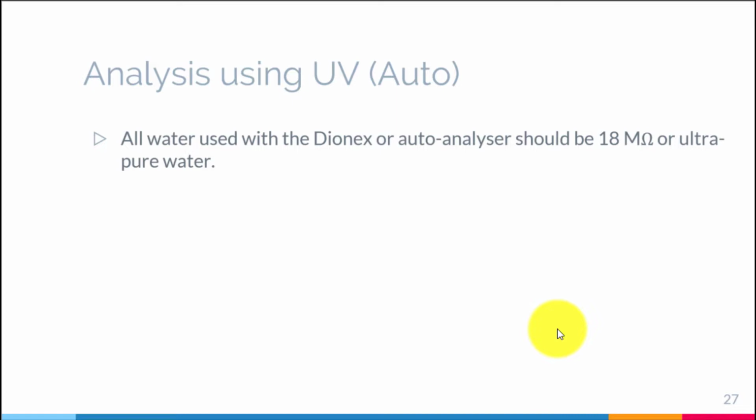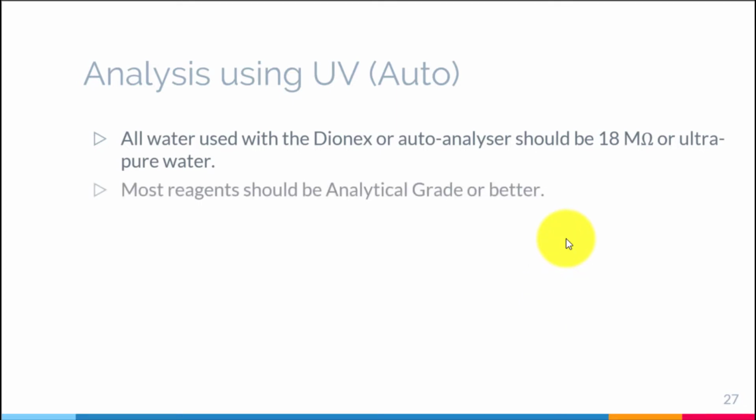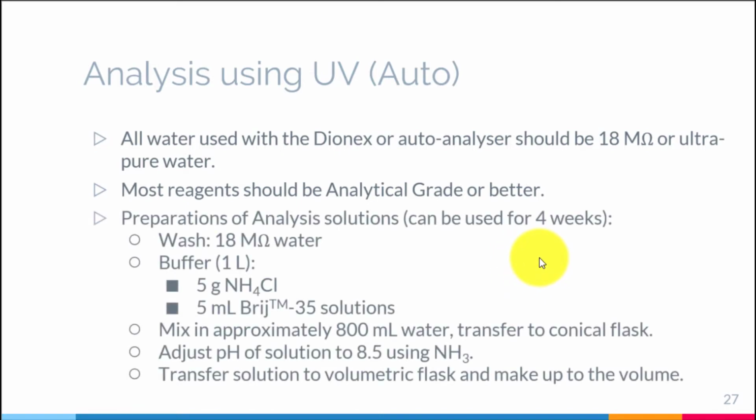You can use this Dionex, which is located in the CM3292 lab. Then you can just analyze, according to your lab procedures. Again, not in this module here, but I just want to give you a complete picture. You need to have buffer solutions. Remember, this is your non-ionic organic surfactant, Brij 35 by Thermo Fisher. Then you need to do some preparation of your sample.